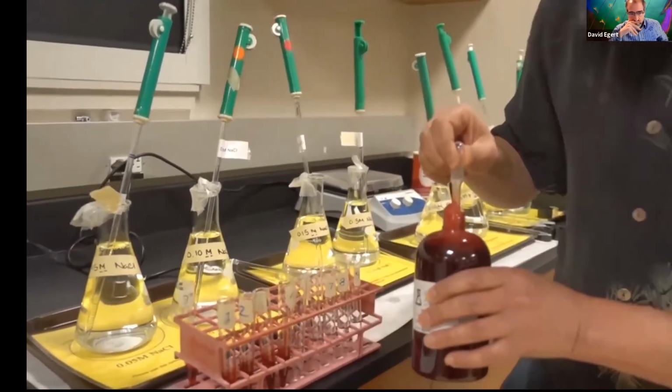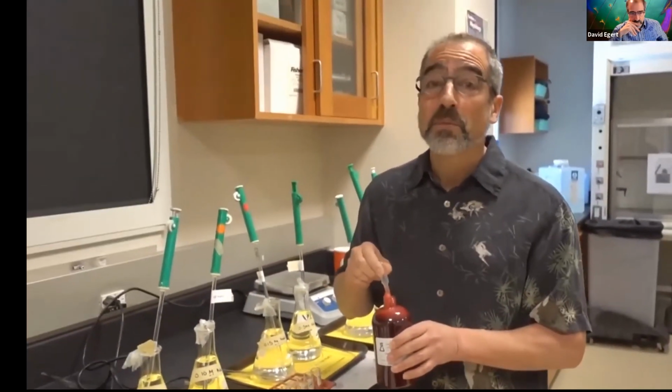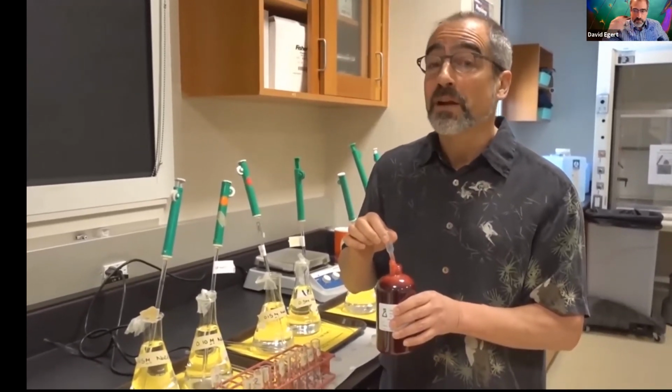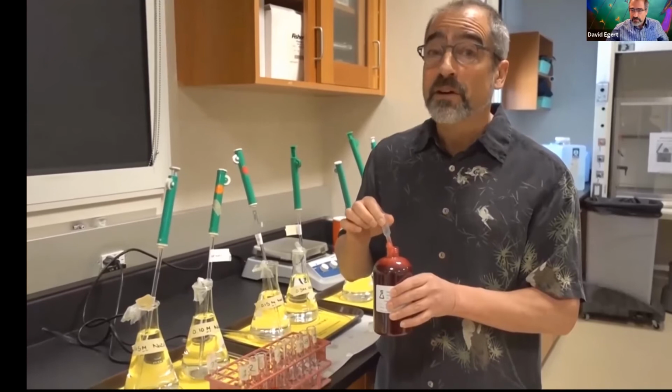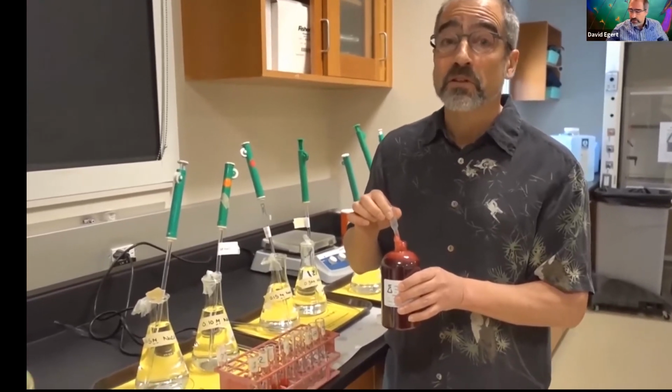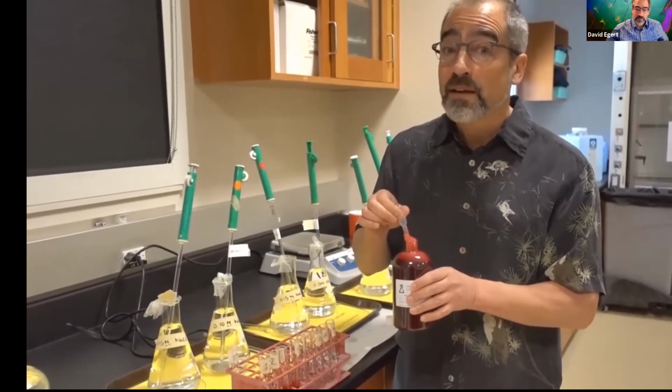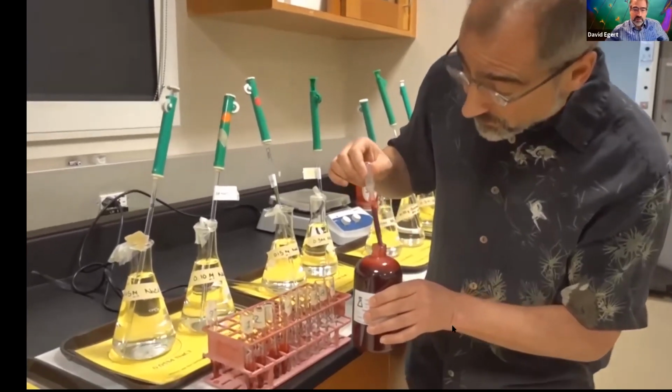I should also mention, this is cow blood, so we don't worry about the safety as much. But if this was human blood, obviously we would be very concerned about safety and be using universal precautions and all that.